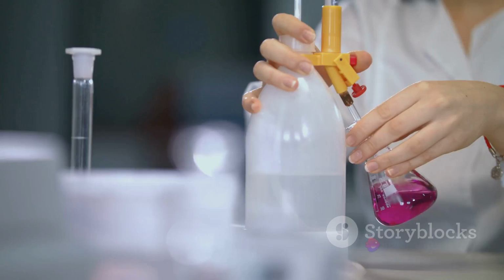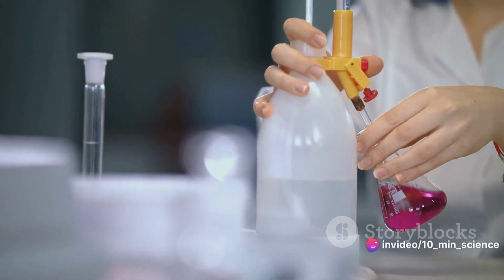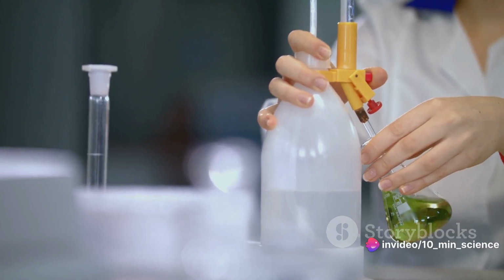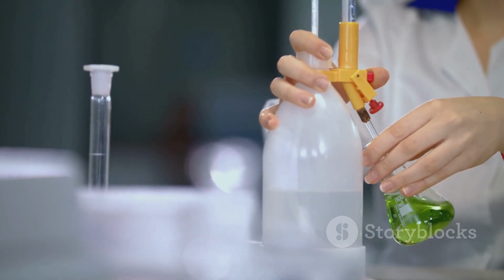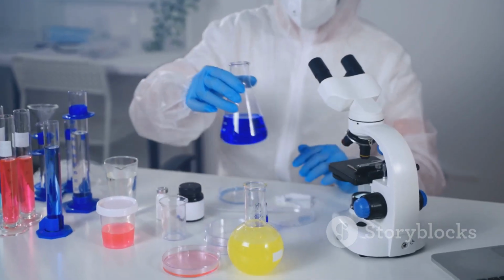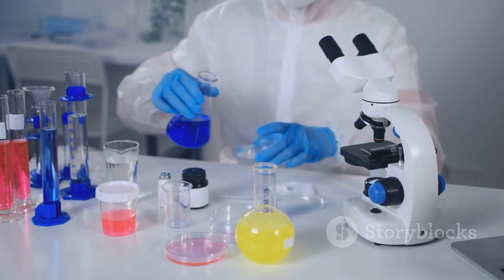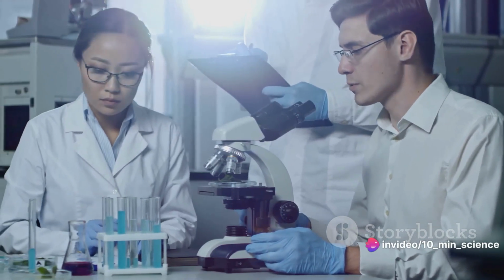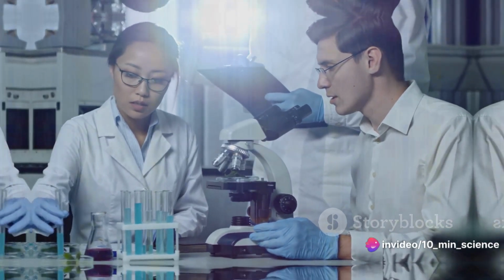Whether it's to ensure the purity of a drug, to identify unknown substances, or even to study complex biological samples, chromatography is the go-to technique. It's a powerful tool that's integral to our understanding of the world around us. Understanding chromatography sets us on the path to unraveling the mysteries of USP Chapter 621.